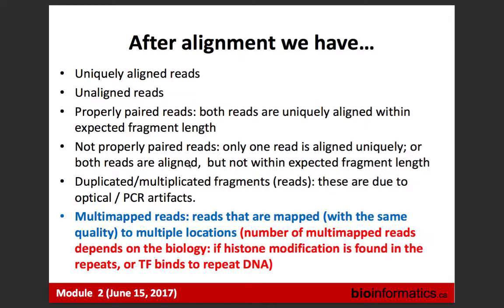Okay, and then the last class. After duplicated reads, we can have reads which align in multiple locations. Basically, the aligner struggles to assign a unique location. It finds several locations, and those reads come from regions of the genome which are repetitive, for example. Obviously a read comes from one spot, but when we try to place it, we find, oh, perfect match here, perfect match 5 kb away, etc. In this case, BWA arbitrarily, not randomly, which is not good, assigns a coordinate. And again, as a recommendation, in most ChIP-seq experiments, we just ignore those. We don't consider them because we don't know where to place them.